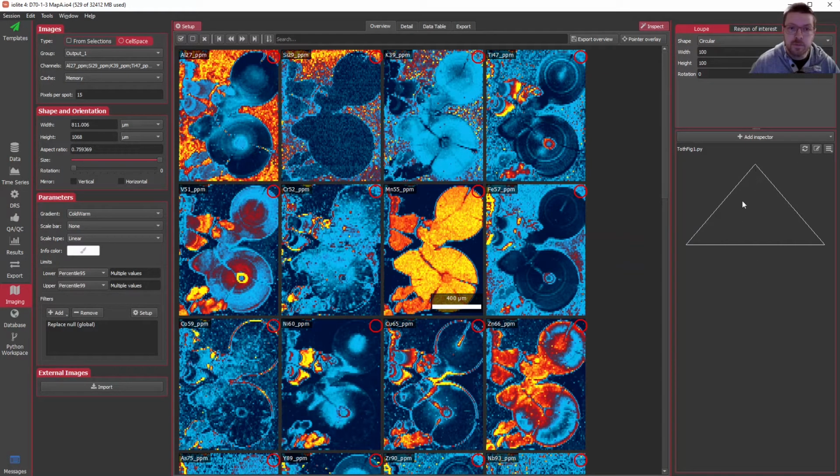I'm not sure if this will come through in the video, but you can see that the lines that are drawn are a bit jagged, and that's because it's not anti-aliased by default. So we could change that to get a nicer line.